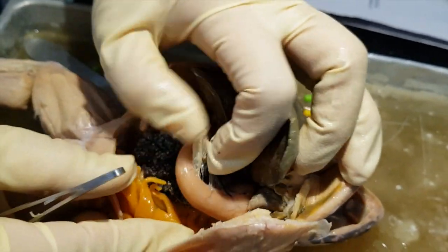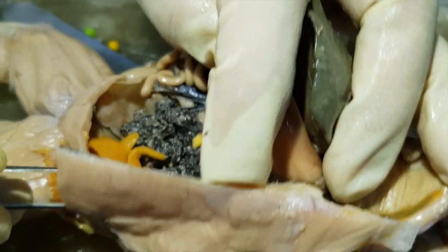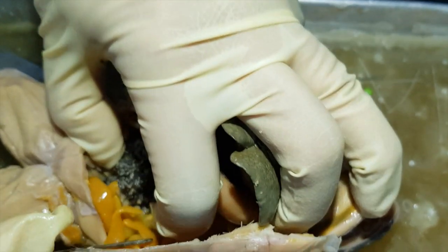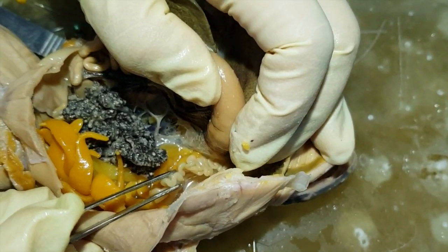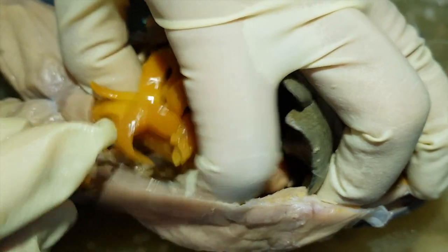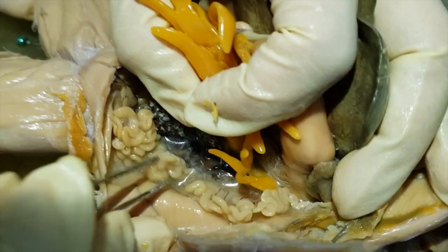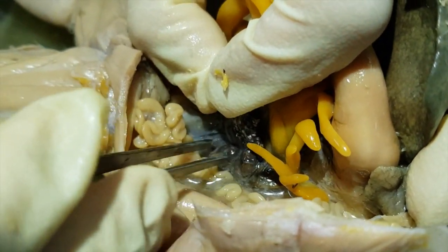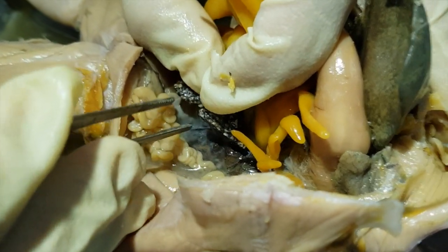These are actually eggs. This is a female, so these are eggs that are ready to be released outside for external fertilization. This whitish coiled structure is the oviduct. These are fat bodies. That's still the oviduct here. Then this red structure on the dorsal side, retroperitoneal in location, is the kidneys. So those are kidneys.